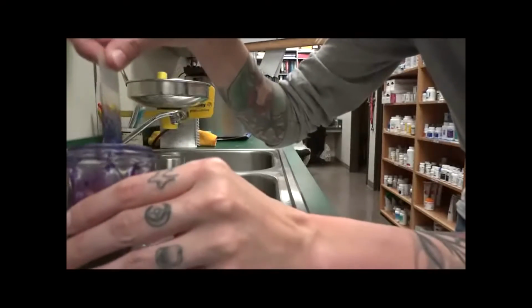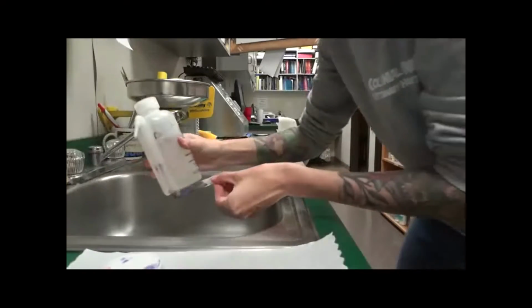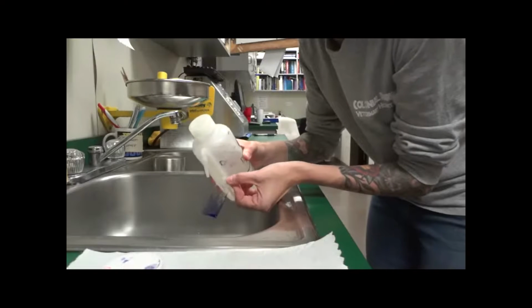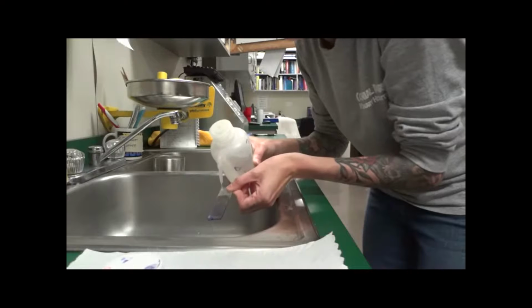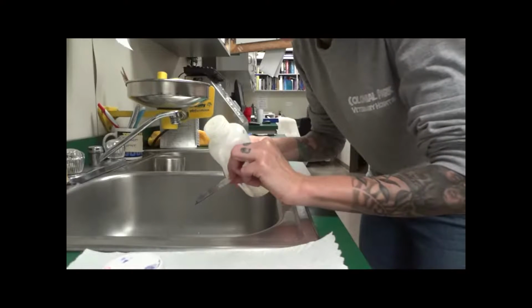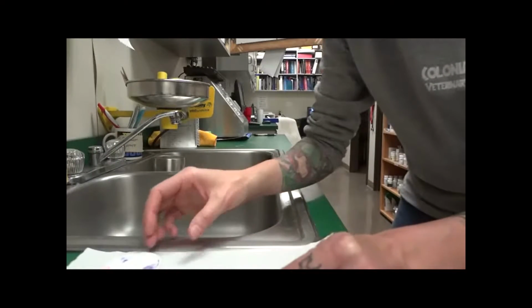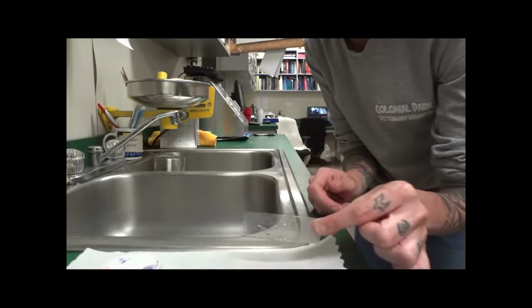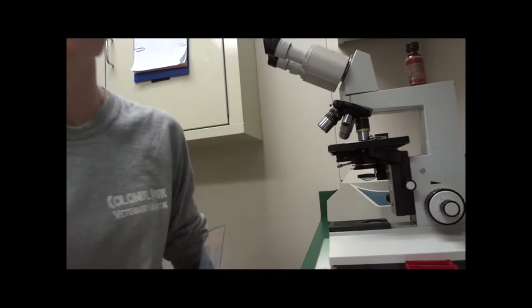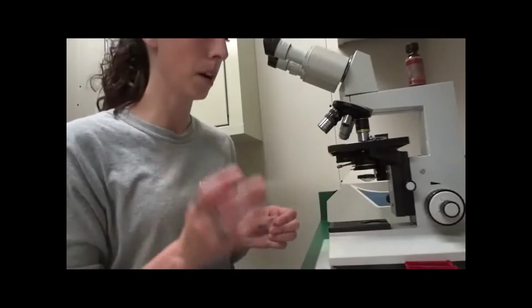Okay, now that this slide has been in the basophilic stain for 15 seconds, we're going to rinse it off with distilled water, not applying it directly to our material on the slide. We don't want too much pressure to hit the cytology itself. We're going to allow this to air dry, and then we'll look at it under the microscope. Alright, we have our ear cytology now. We're going to be looking at it under the microscope.